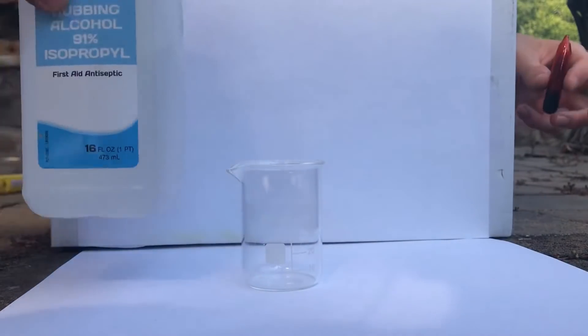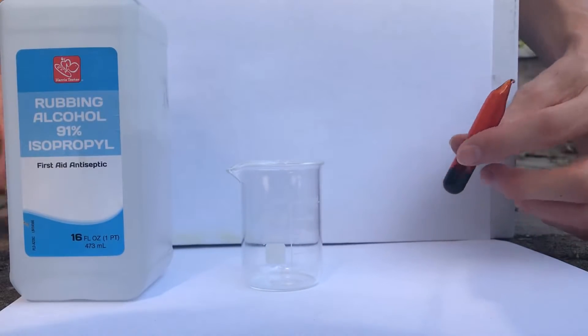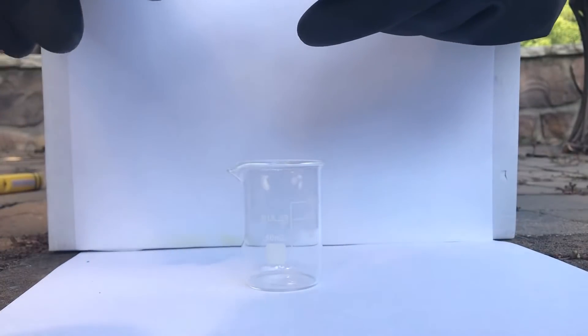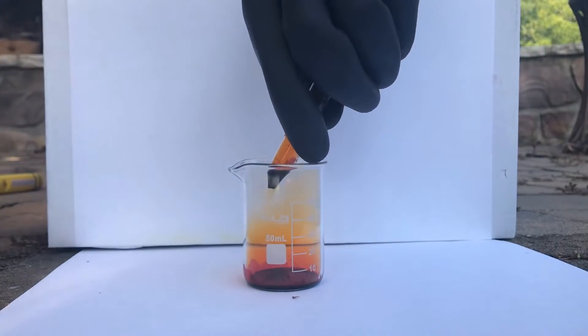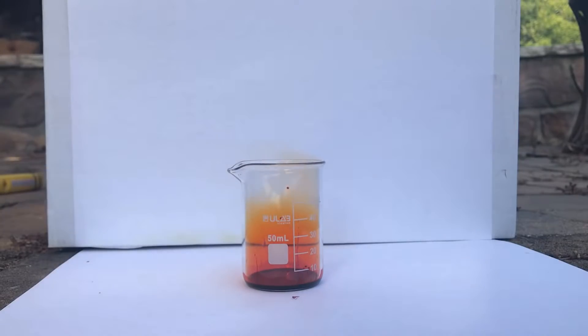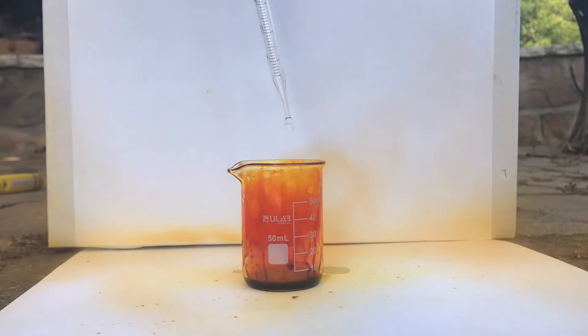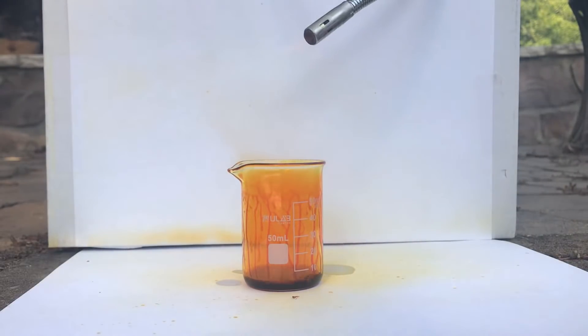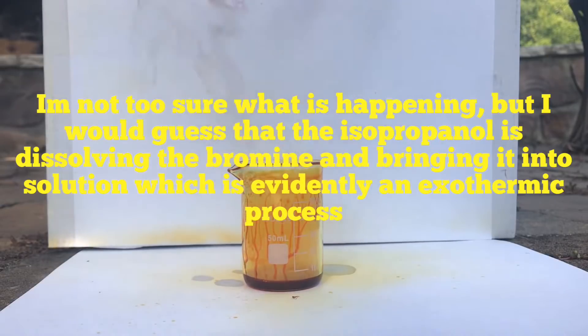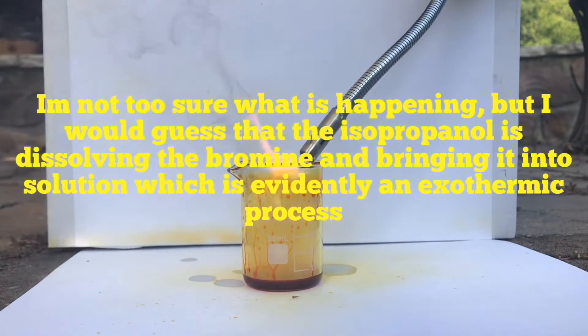Alright, now we're going to be reacting isopropyl alcohol with bromine to see if it even reacts. Alright, so bromine's going to go in first as we're dropping it in. Okay. Whoa. It actually dissolved the bromine. Watch this.